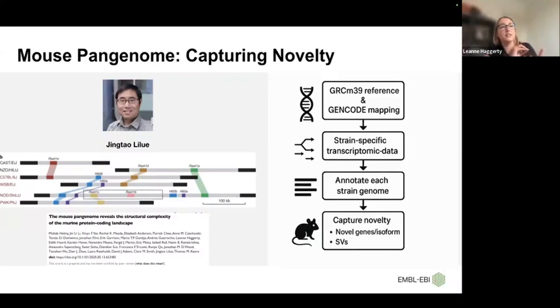So there are targeted consortia that we work with and contribute to in terms of running comparative genomics. But you could also just come and take our data. All of the data is open source, so you can do your downstream analysis. I hope that's fueling that by generating as much data as possible. Also, as I harp on about a bit, do get in touch with us if you have a community with a group of genomes of interest that would benefit from us running a Cactus alignment. We have the resources. Let's generate those, and if it benefits the downstream community, give us a shout.